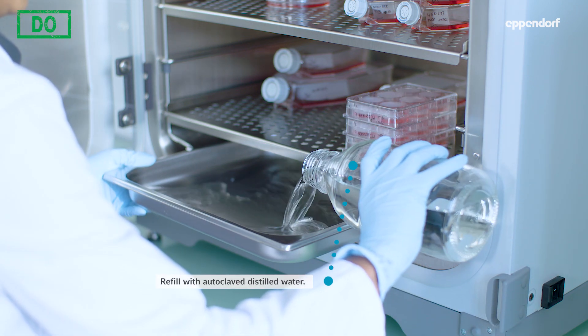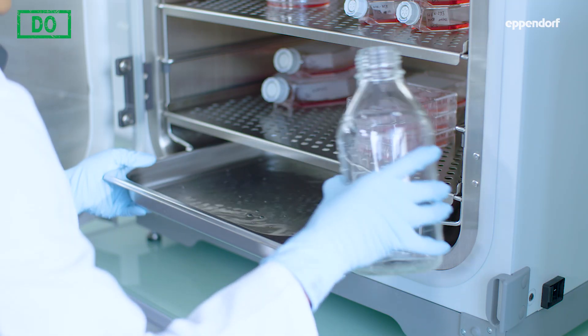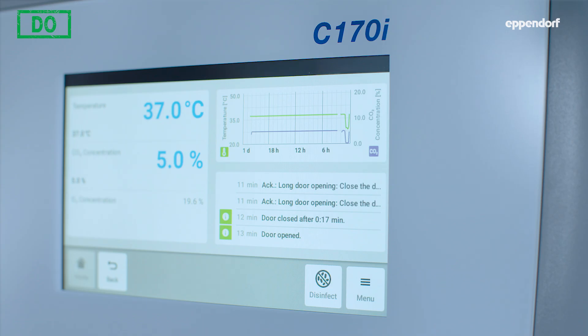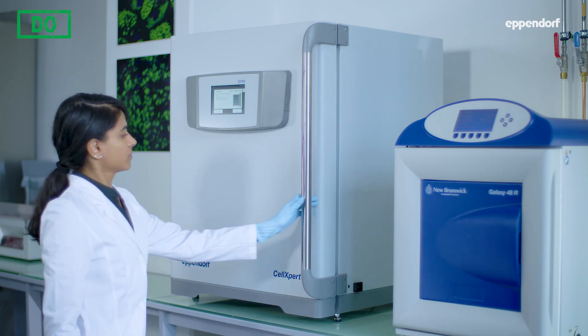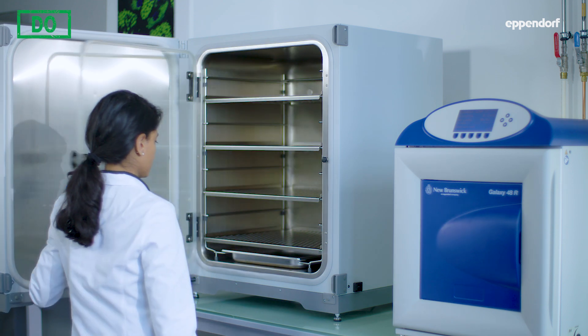Use autoclaved water to refill. To further minimize the contamination risk, your incubator should also be sterilized regularly. Running an automatic high temperature disinfection program overnight is the most common method.